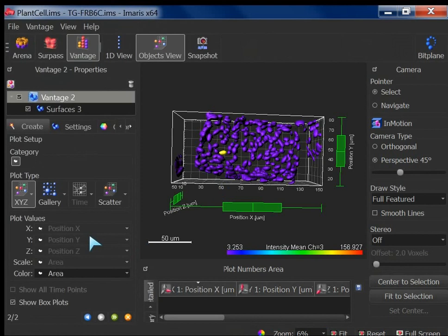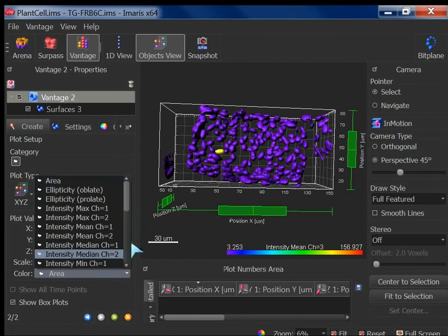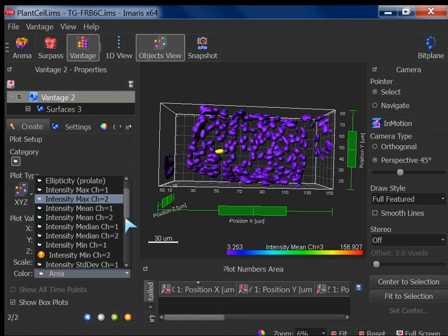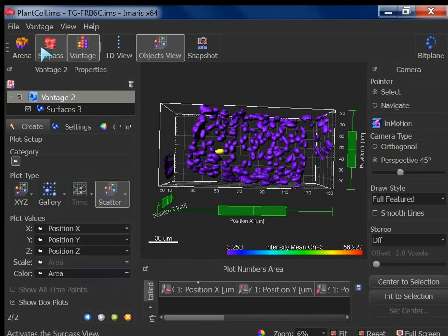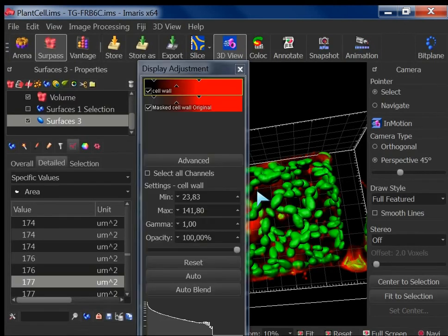And now you are left with only one channel. Go to scatter, and if you go here, then only channel number 1. Okay, what is this, channel number 2 is there? Okay, so 1 and 2. Again, you have to go back and see what your interest is. No, it is not possible. You have to be in surface view and press Control D. So that's the second one.